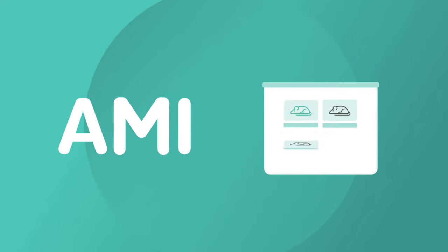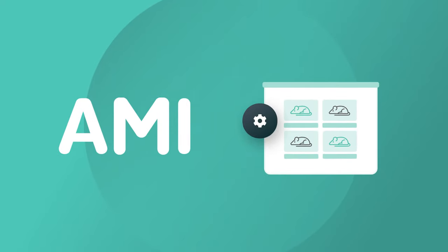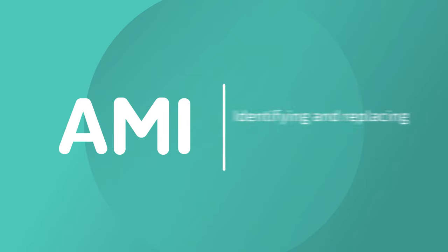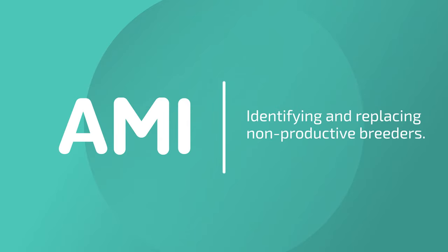Hi, I'm Amy. I'm here to provide the proactive insights and functions you need to maximize the efficiency of your colony, such as identifying and replacing non-productive breeders.